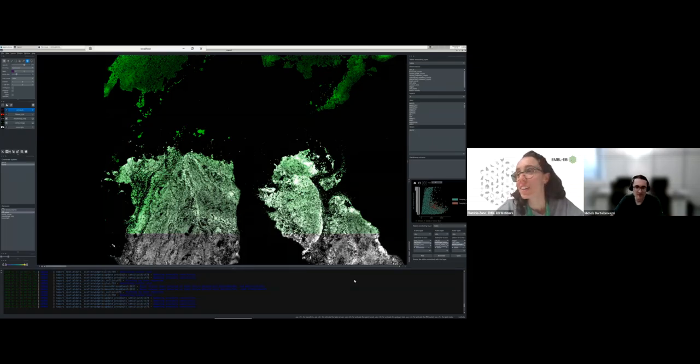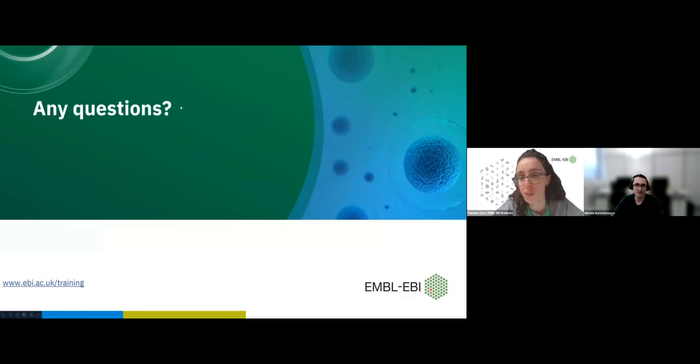Perfect. Thank you. I think maybe we can take a last question. We're almost 10 minutes past time. Let me see. Okay, I think there are two questions that are connected, so maybe we can take them together. One attendee is asking, does Napari work with direct instrument output, or do you need to shape the data somehow before it can be imported there? And another person is asking, can I use Napari to visualize H5AD spatial data? Basically, at which moment of my workflow processing can I import the data in Napari?